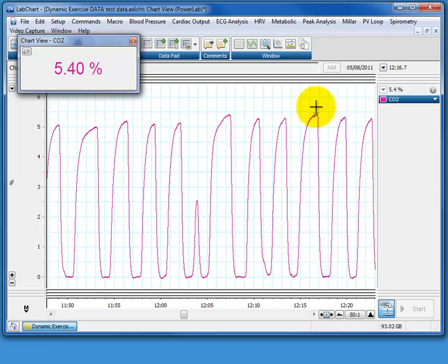It would also be probably the most time-consuming job you've ever done, because we've got a lot of breaths here over a lot of time, and it's going to take you a very long time to go through the entire protocol, writing down all of these numbers, and the risk of any typographical errors or misalignment is quite high, owing to the amount of work that's involved.